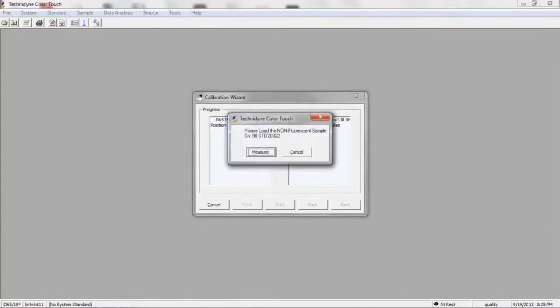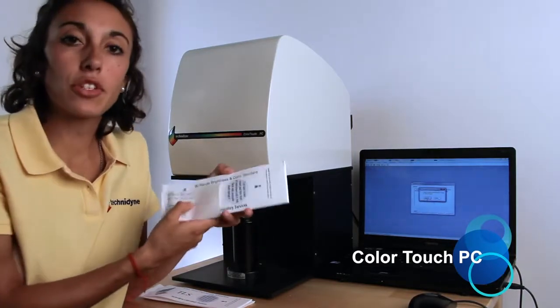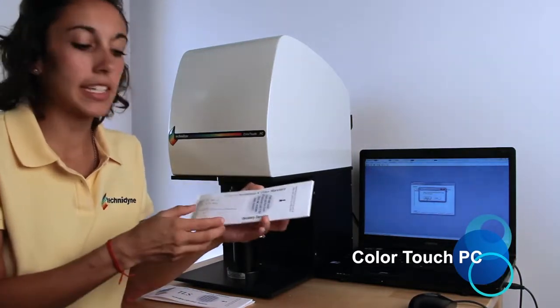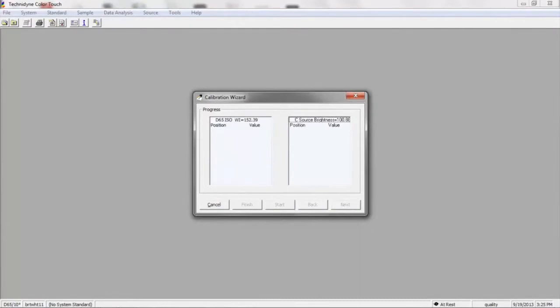Next, it wants us to load our 90 standard. It's important to verify that the serial number on the 90 standard matches the one that the computer's giving you. As long as it does, we can move that printout as well as the cover sheet back, and we'll load our standard. We're going to press the green button on the side of the instrument to measure.